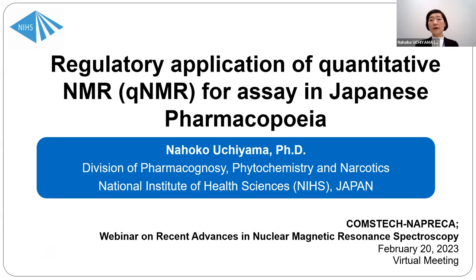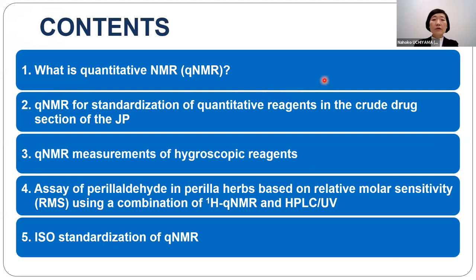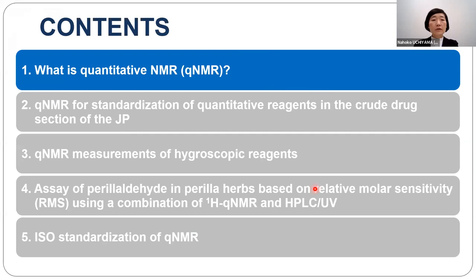Thank you for inviting me. Good morning and good afternoon, everyone. I'm honored to speak at this webinar. Today, I would like to speak about the regulatory application of quantitative NMR, qNMR, for assay in Japanese pharmacopoeia. I would like to speak about these five topics. The first one would be, what is quantitative NMR, qNMR?